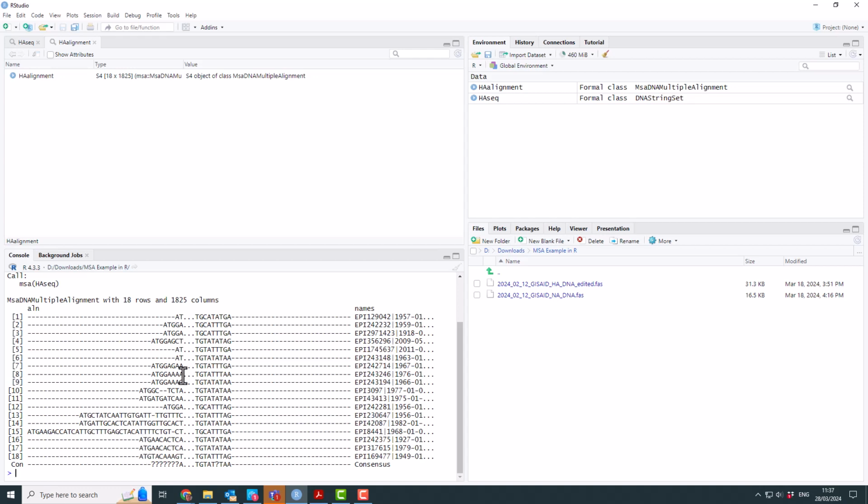So this is suggesting that this is not a very good alignment, and we should probably look at other programs or changing the parameters to get a better alignment. This isn't completely unexpected because ClustalW is a very old program. People shouldn't still be using it. The preference is to use MUSCLE and Clustal Omega.